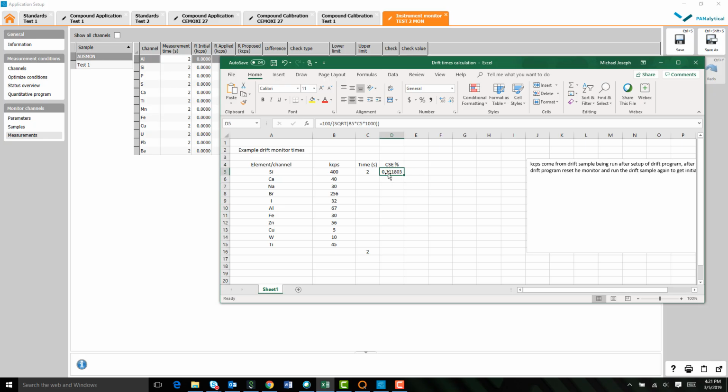So we're always trying to reduce the counting statistical error, and generally I like to make it 0.03 or less. So what I like to do is see how much time I need to make it that. Pretty close, 26 seconds, not bad. So then I would go ahead and do that for all of these. Just play with these here, and this is a total sum. Again, just keep in mind how long these have to run for.